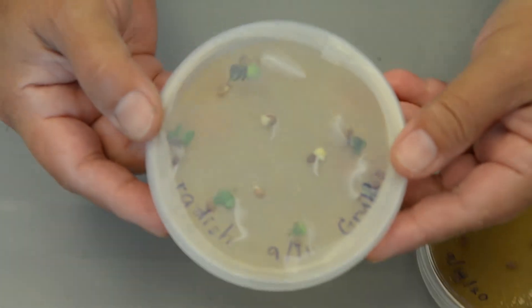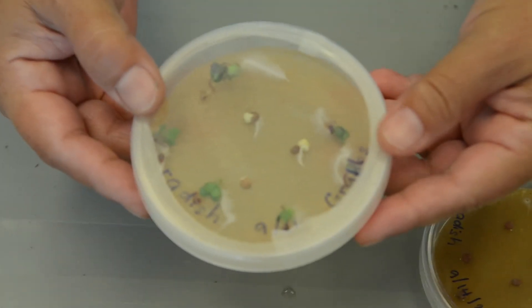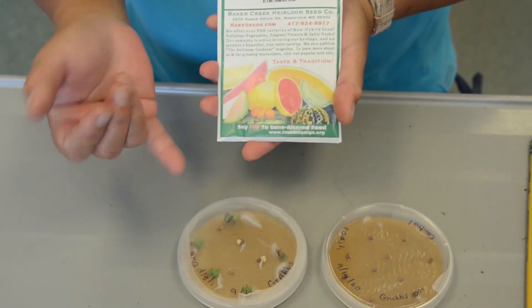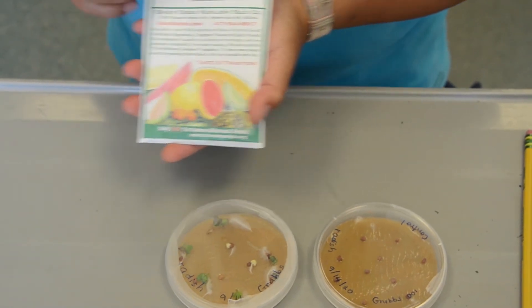Eventually it will turn green. Because I used a seed mix of different kinds, that's why they didn't germinate at the same time.